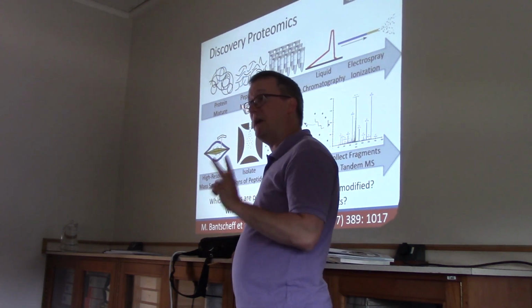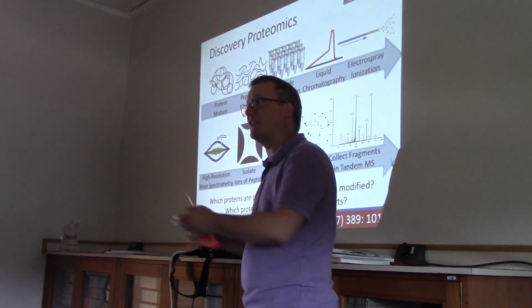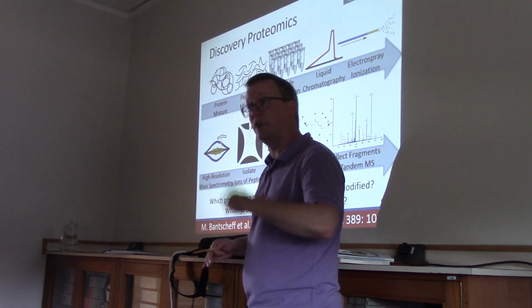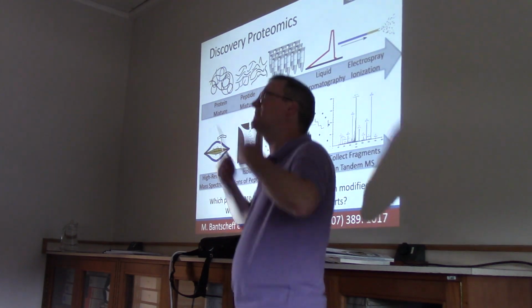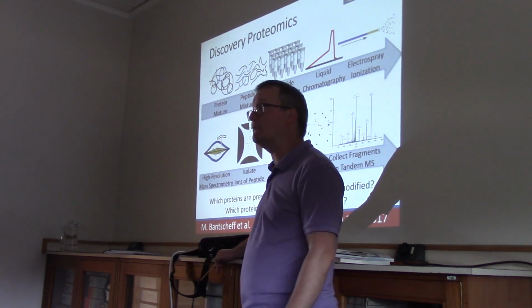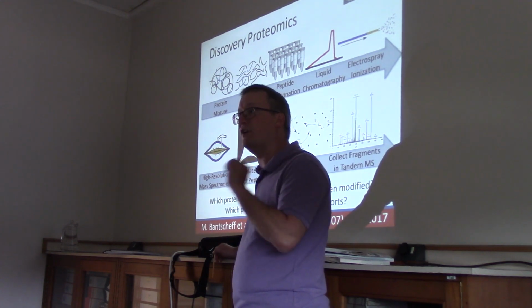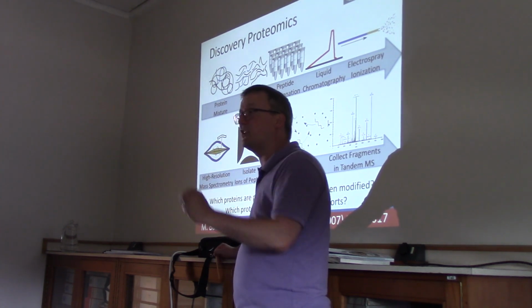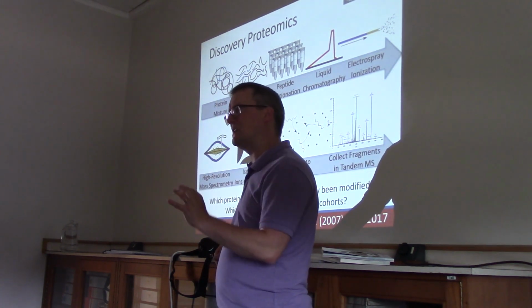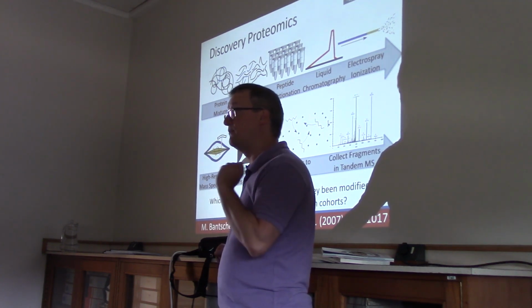And we're going to measure these peptides that are appearing in solution in two different ways. And remember that the liquid chromatography is going on for about an hour, and the mass spec is doing this work repeatedly for each of these different instances of time throughout that gradient. So first off, we're typically going to use high-resolution mass spectrometry, maybe Fourier transform mass spec, in order to get a very, very accurate measurement of the precursor ions. We call them precursor ions because we're interested in tandem mass spectrometry, but what you need to remember is that a precursor ion here is a peptide.